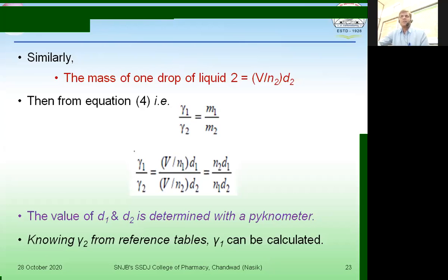The liquid which was in the stalagmometer will be taken into the beaker now, and the liquid which was in the beaker will be taken into the stalagmometer, allowing the liquid in the stalagmometer to form drops when the lower end of the stalagmometer is immersed in the liquid in the beaker.